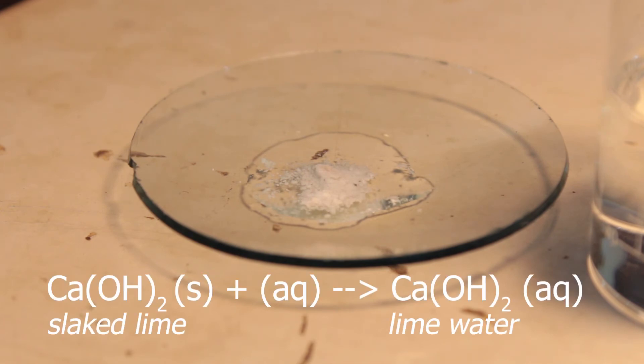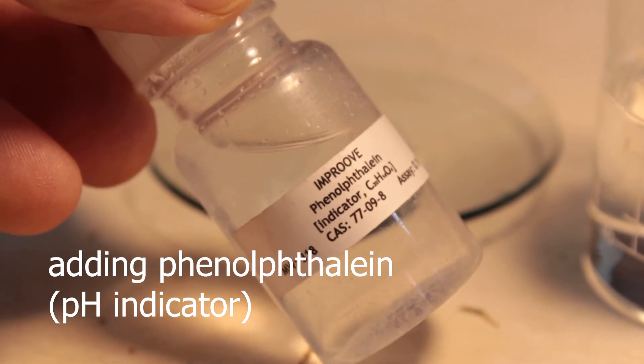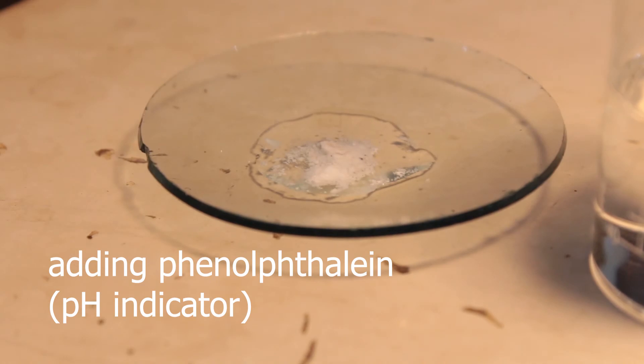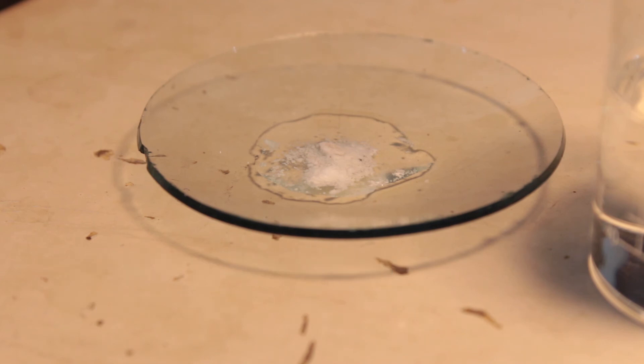But calcium hydroxide is soluble, and now I'm demonstrating it. Adding phenolphthalein indicator to check alkalinity. Calcium hydroxide should be alkaline. Phenolphthalein indicator is colorless in acidic conditions and pink in alkaline.